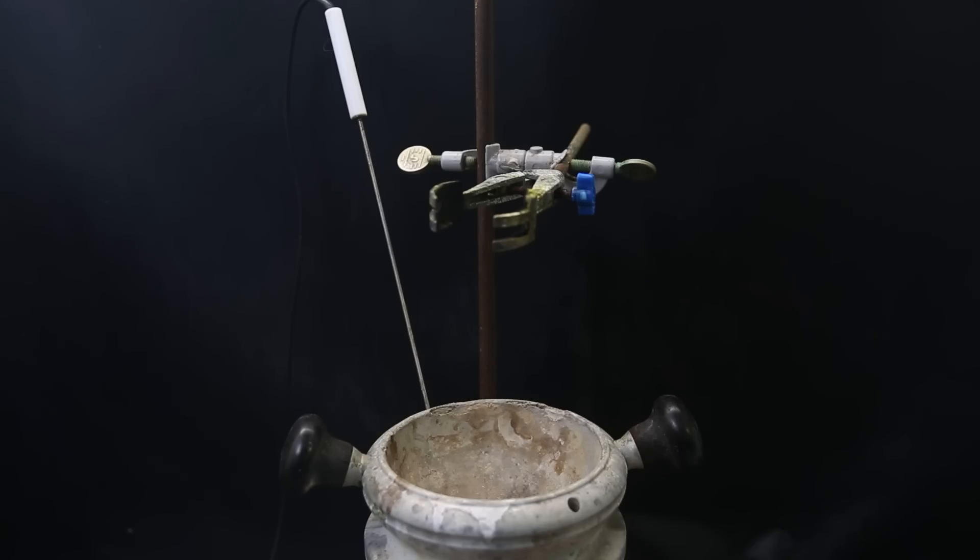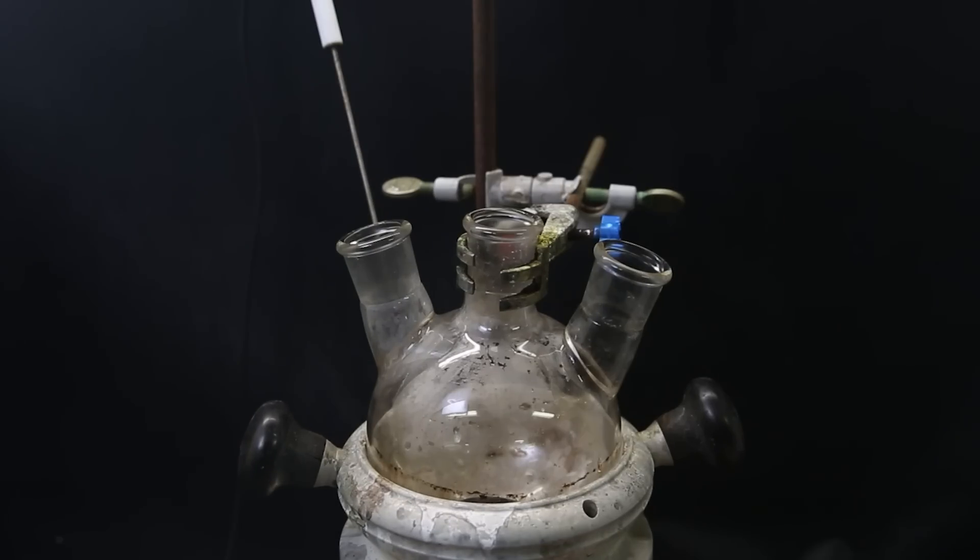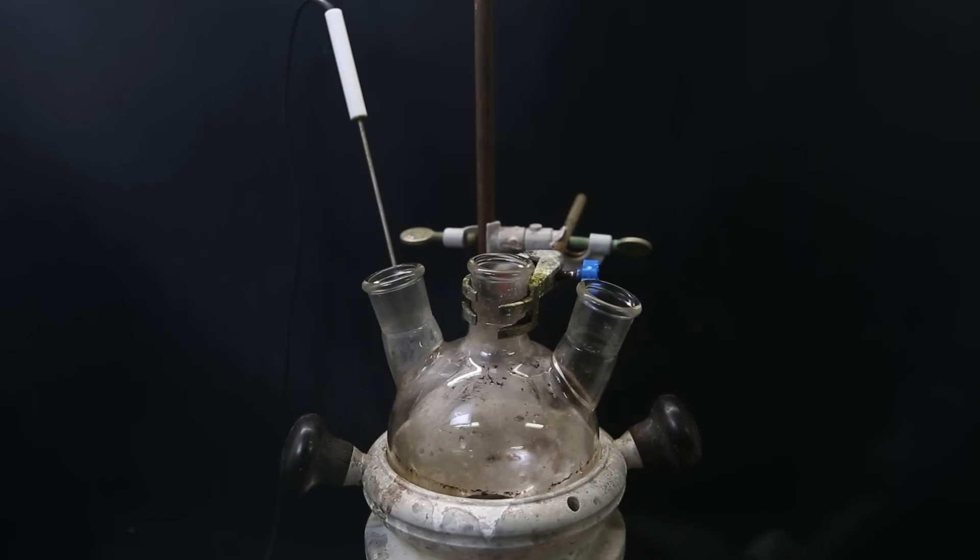To get started, I set up a heating mantle, and I will use a 1-liter 3-neck flask. It's still a bit dirty from some tar that doesn't want to come off, but for the reaction, it doesn't really matter. And afterward, it will have cleaned my flask, so it's a double win.